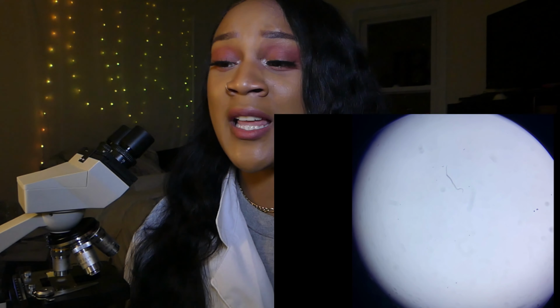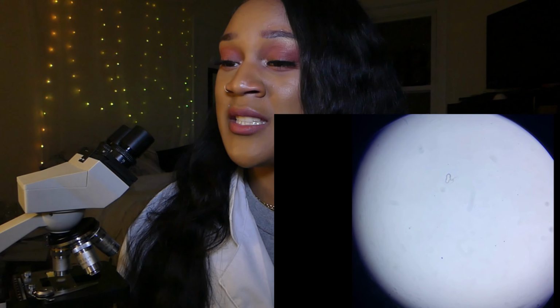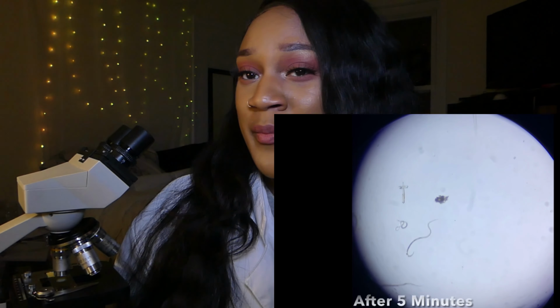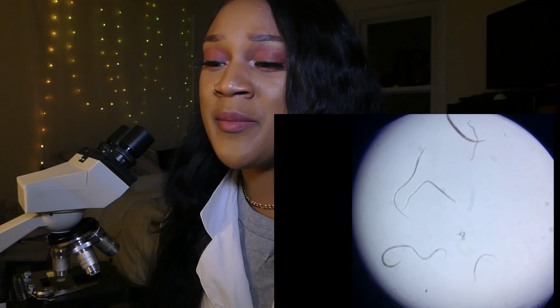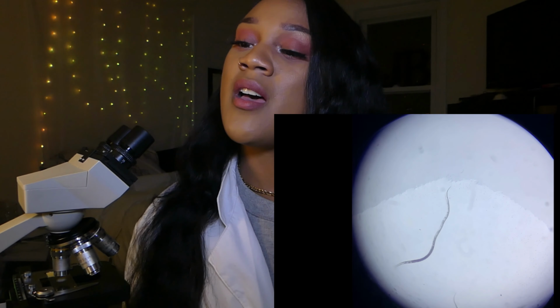After 3 minutes, you can see the effects the alcohol is having on the microbes. The smaller ones are dying or dead right now. This one here is just trying to cling on to life, but it's just not giving. After 5 minutes, the medium-sized ones are starting to die. The larger ones are starting to feel the effects as well.